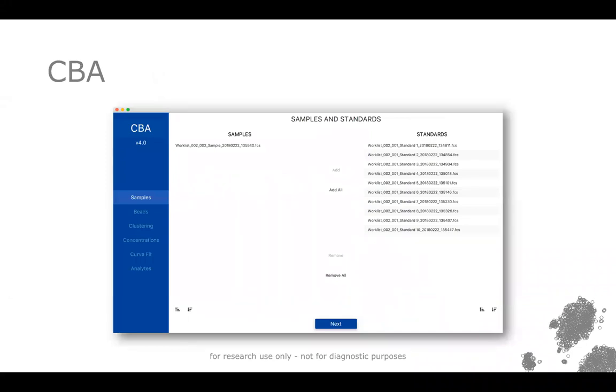And then last but not least, we've just done a big update for the CBA plugin, which is a cytometric bead array tool that can be used to analyze CBA data. So actually a lot of researchers out there are doing CBA, and currently they're forced to use other third-party softwares that are maybe not so easy to use. We've tried to make this very simple, but also powerful. And it works in conjunction with all the tools available within FlowJo. So running CBA analysis with the CBA plugin, we hope, would allow people to have a little bit more robust experience and be able to keep all of their analysis right there within the FlowJo ecosystem.